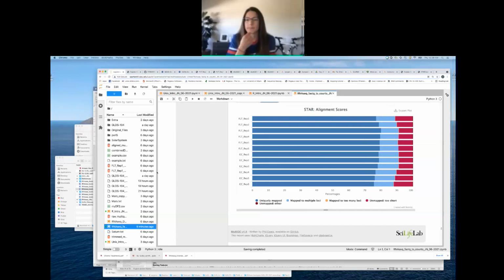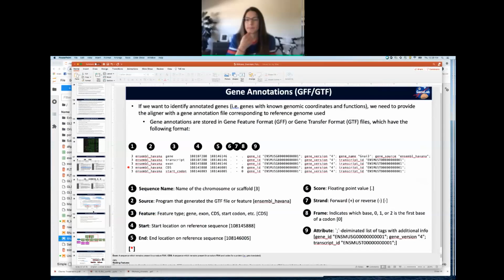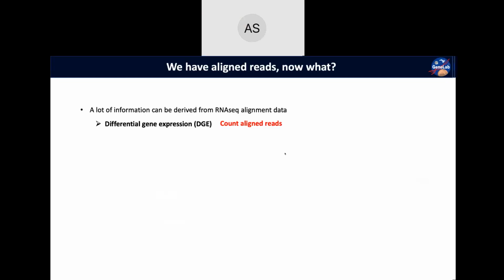Okay, cool. Let's take a break from the notebook and let's talk about how we start counting this stuff. So I'm going to turn off my video for the lecture part. Okay, so we have aligned reads, now what? There's a lot of information that can be derived from RNA-seq alignment data. Of course, differential gene expression, which is what we are going to be generating. However, in order to do that, we need to count our aligned reads, which is what we're going to be talking about now. But there are more things that you could do than just that.